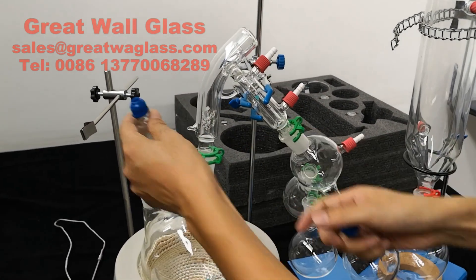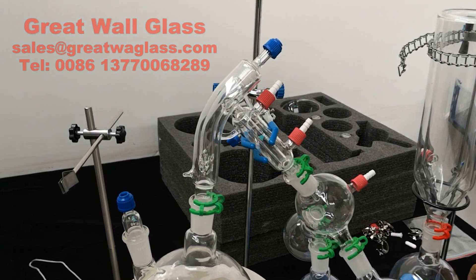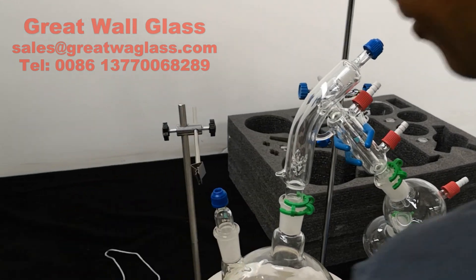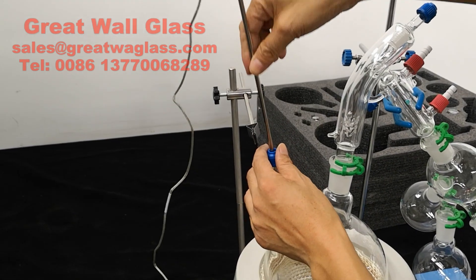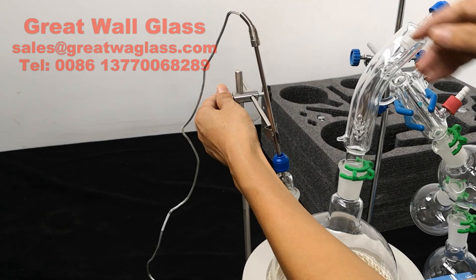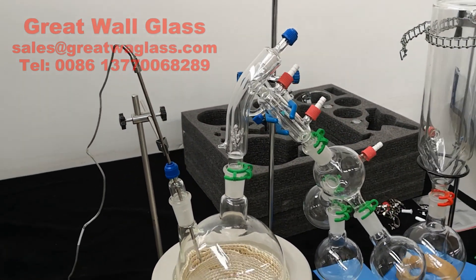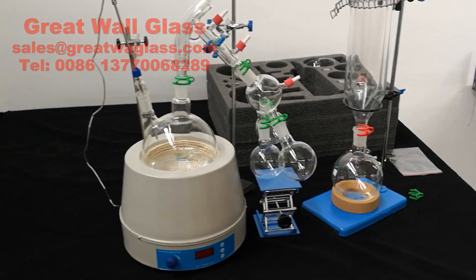We put all the clamps on, and we put on the adapter, which is for the SOMO couple. We put it in the SOMO couple and secure it again with the support. That's all for the assembly. Thank you.